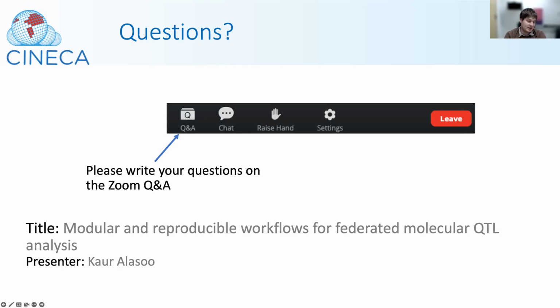That's a very good question. One of the things that we're working on right now is the genotype imputation workflow. The genotype imputation workflow that we have right now, GenImpute, only works with genotyping microarray data, and we're now working on another workflow that also supports low coverage genome sequencing.